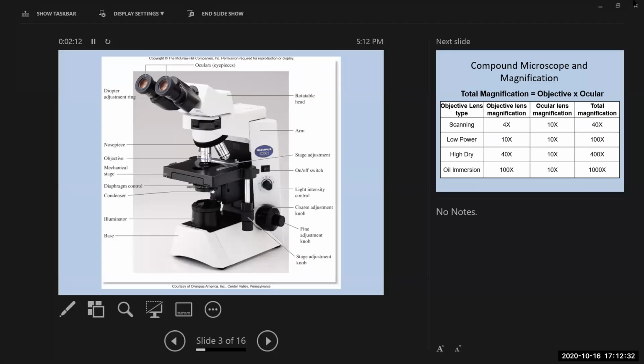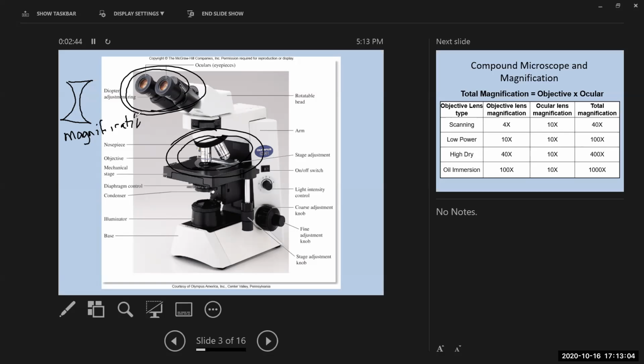So when you're using a microscope, and you may know this already, most microscopes have 2 sets of lenses, and the lenses, of course, magnify. Magnification lenses are looking like this. All right, so this is what the shape of the lens is. I think it's called concave. Magnification, all right? And so there's 2 sets of these biconvex lenses that are going to ultimately magnify the slide that we have down here.